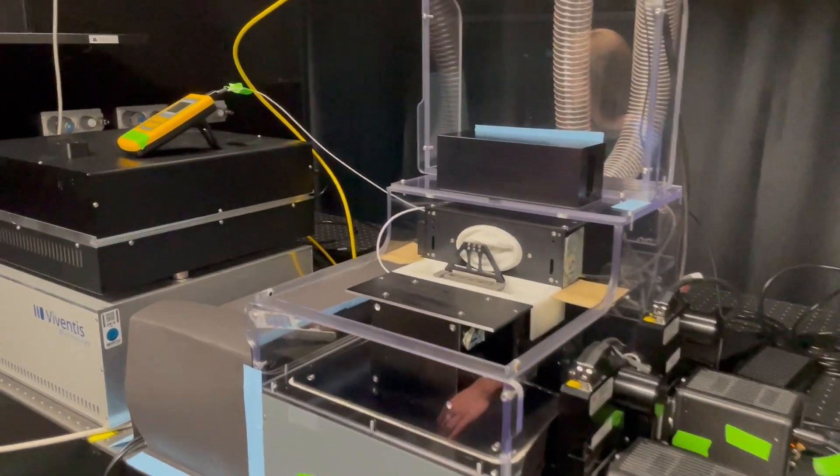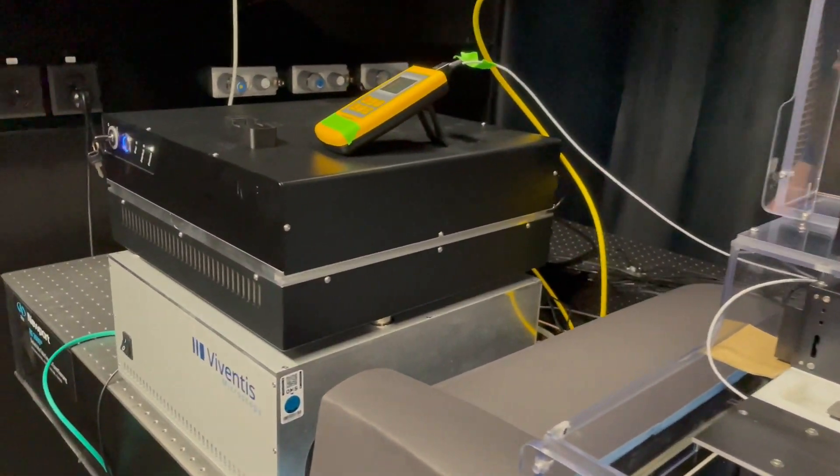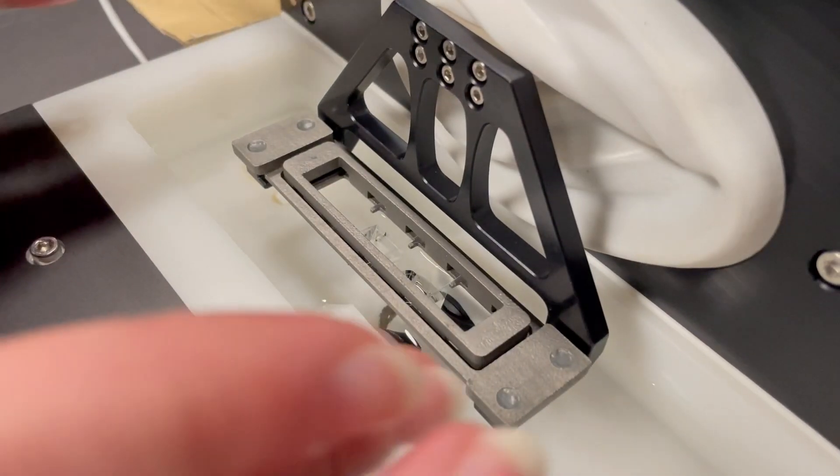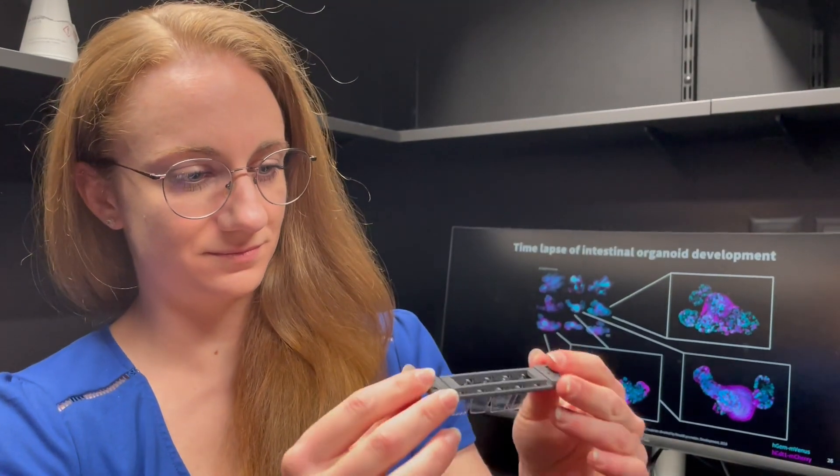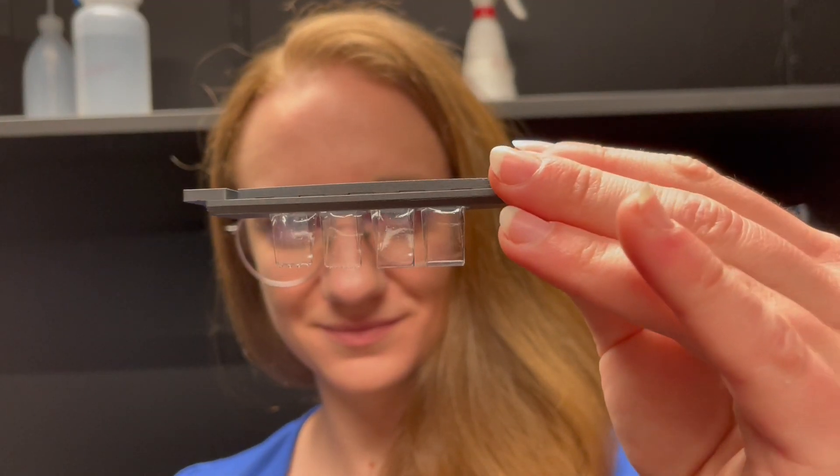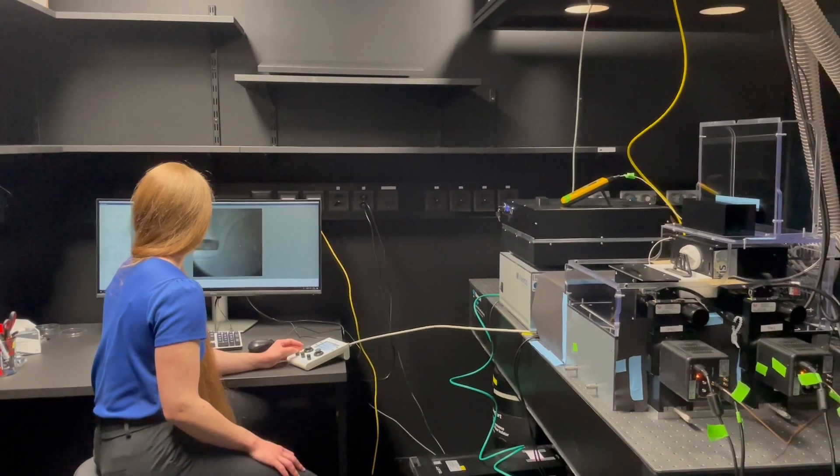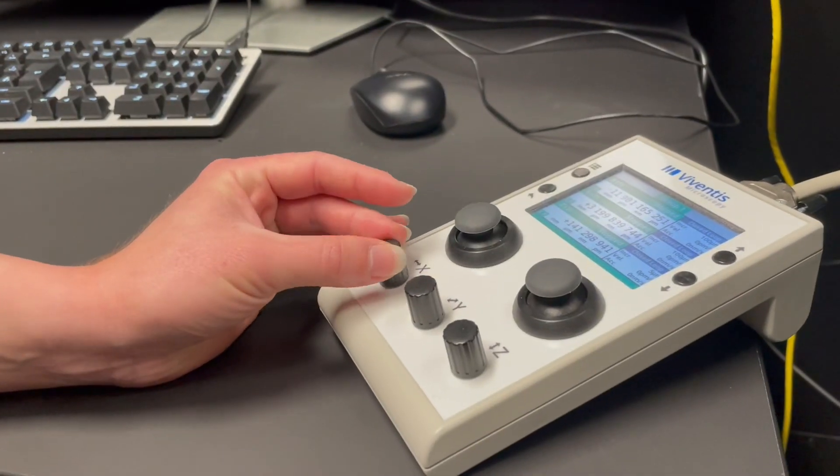Our microscope combines the open-top light-sheet approach together with the multi-view approach. This means we can access the sample anytime for medium changes or to add compounds to the samples, but we can still image them from two opposing sides by the unique arrangement of our objective lenses.